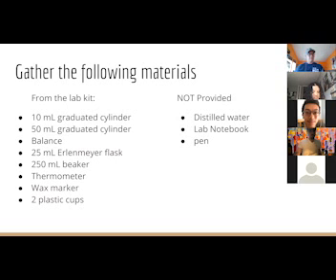We just need one? Yeah, just need one. Yeah, because we're only going to be using water today. So we'll just use the same one. If, on the other hand, you're using like 2 different solutions, then yeah, I would use two different transfer pipettes, because you wouldn't want to mix them up. Like if I had one for acid and one for base, I'd want to make sure I was using the same one. Okay, so distilled water.